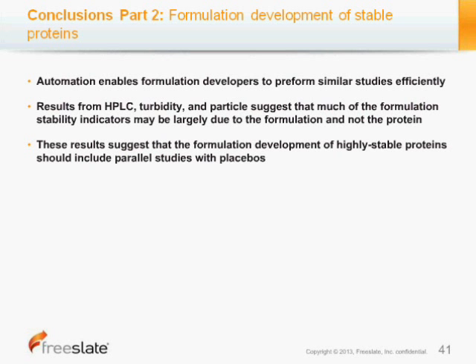And I'll take a moment here to mention that all of the materials that were used to formulate were USP or multicompendial grade excipients or buffers. So these were basically the same grade chemicals that would be used in protein formulation laboratories.